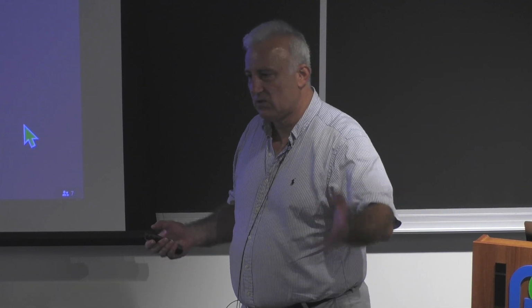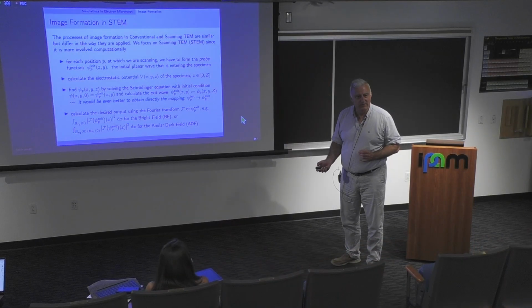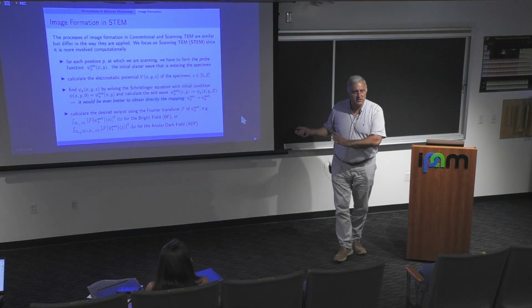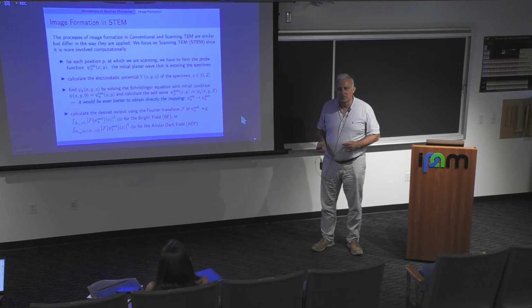Then, based on that, we can train a neural network which would receive the results. But you don't really gain anything if you train a neural network on one particular specimen, right? Because then you have to train it for several others. But I'll talk about this a little bit later, when I discuss further development.